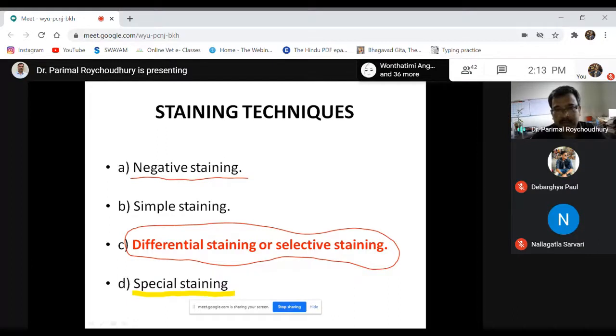We are going to discuss some of the highly fatal and pathogenic organisms under the gram-positive category which produce endospores, and their location, size, and shape help us in understanding and identifying those organisms. So special staining techniques include endospore staining.